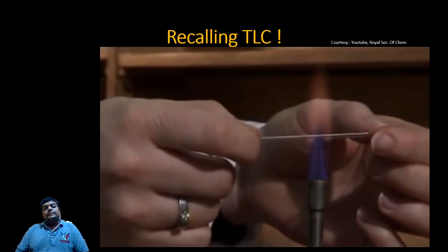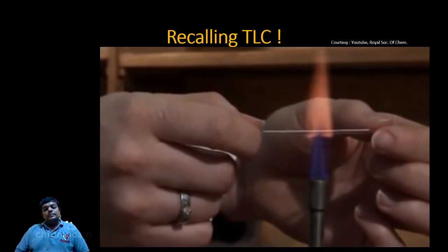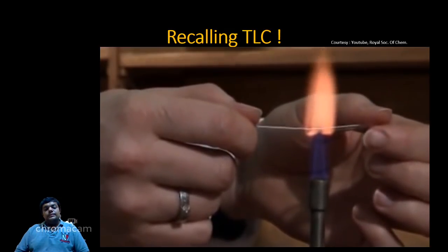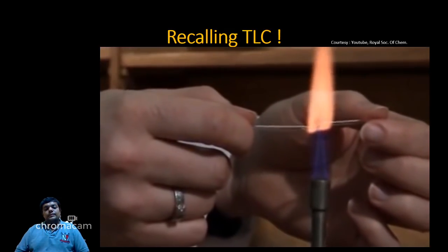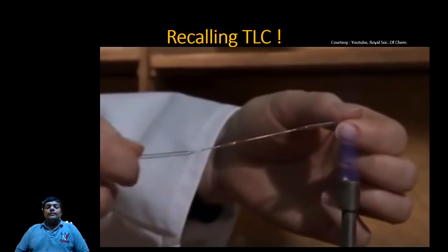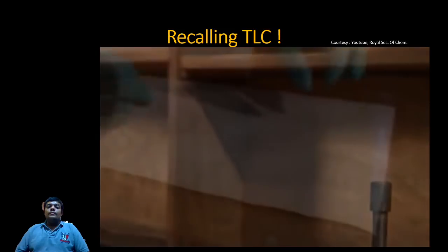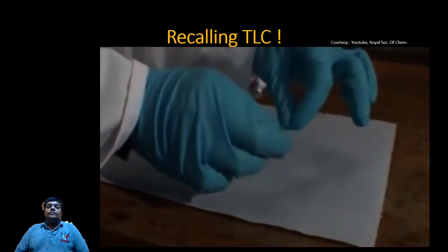Flame. Rotate the tube gently to ensure it's heated evenly. and when it starts to give, take the tube out of the flame, leave it for a split second, and then sharply pull out both ends of the capillary to form a very fine tube. Allow this to cool, and then snap the tube to produce 2 spotters.